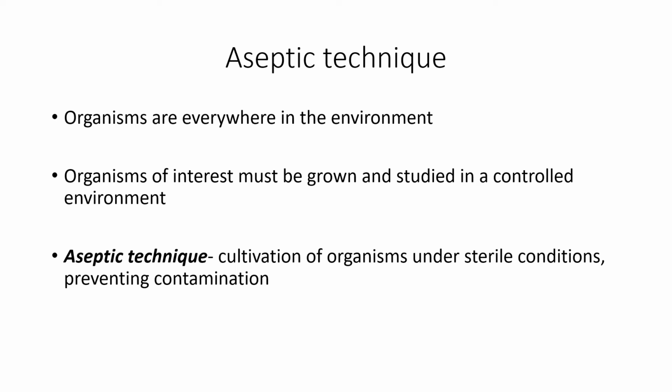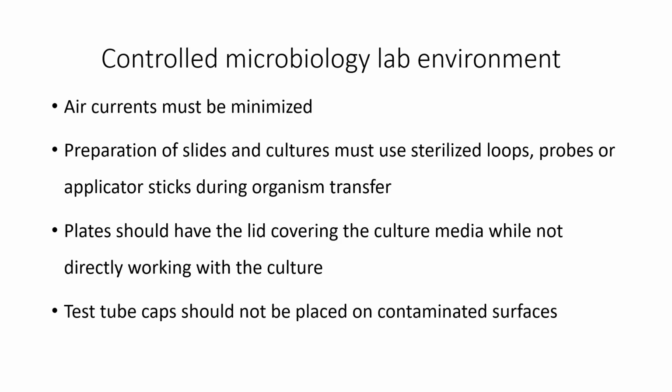All culture and sensitivity tests must be set up using sterile techniques. The microbiology laboratory must be a controlled environment. So air currents have to be minimized, so you don't have spores blowing onto your plate. We want no fans in the room, we want all doors closed, and we want to keep our air currents to a minimum. We want to prepare slides and cultures using sterilized loops, sterilized probes, or applicator sticks that have been sterilized during our organism transfer.